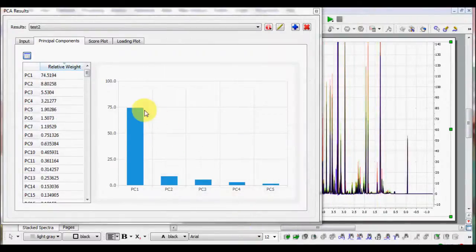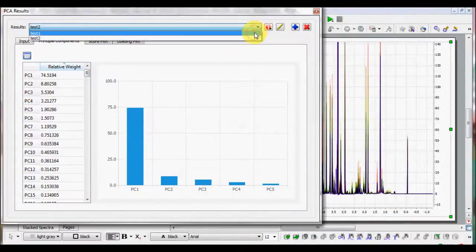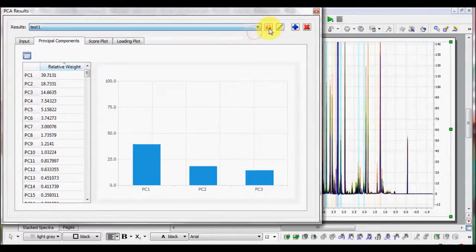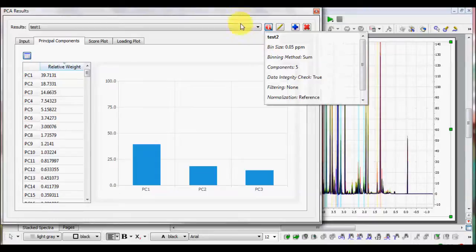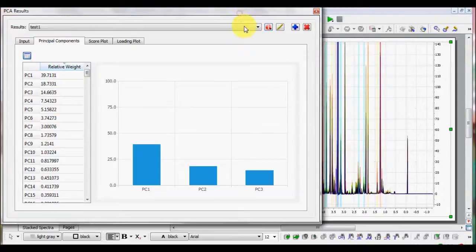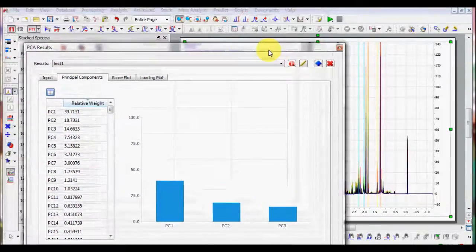All the analyses done are saved into a Emenova document and you can scroll all the analyses performed and look back at your results. Once you save the Emenova document, all the analyses are kept.